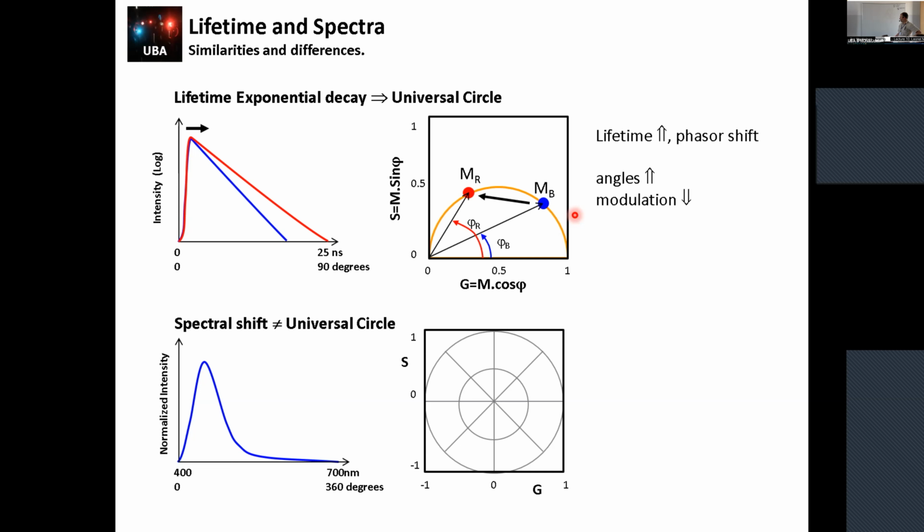Well, first of all, as Enrico mentioned, and also Richard and Dave commented today, to do the phasor transformation, we need a period. And this is an important thing. We always need to have a period, and this period needs to be fixed. We cannot change it, because otherwise our reference transformation will change, right?